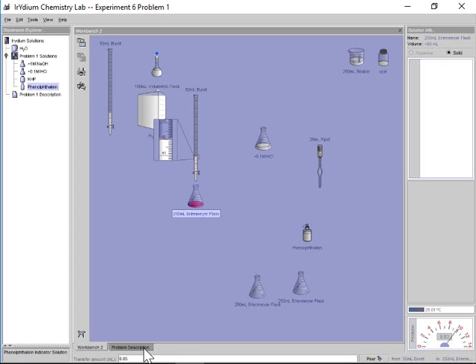But at least I know from the first titration we're roughly needing about 30 milliliters, which is nice because it's going to have actually 1 more sig fig. So let's see if I have any leftover NaOH here. I have 9.62 left. Let's see if I can dilute this final sample, make use of everything. Let me just redo that dilution.